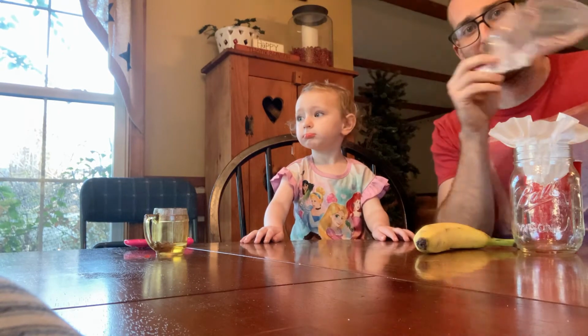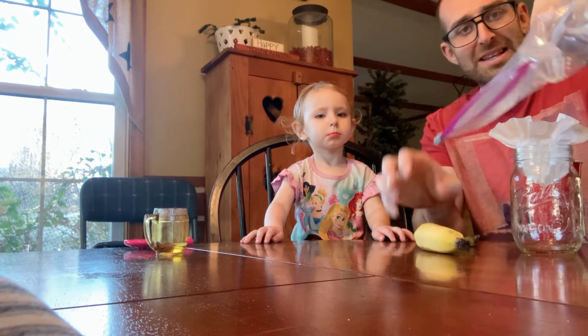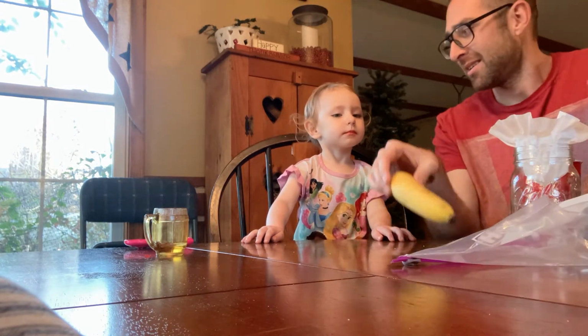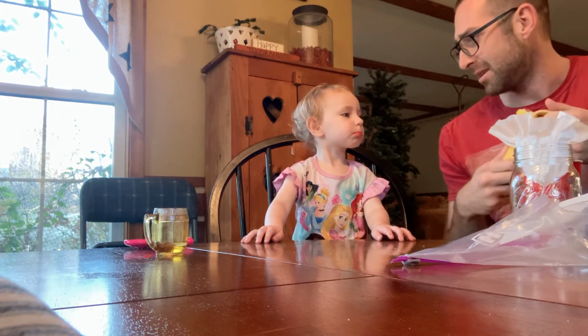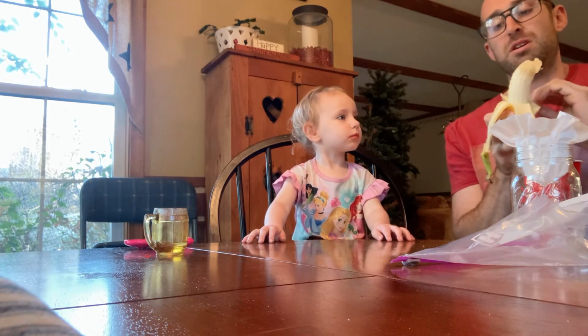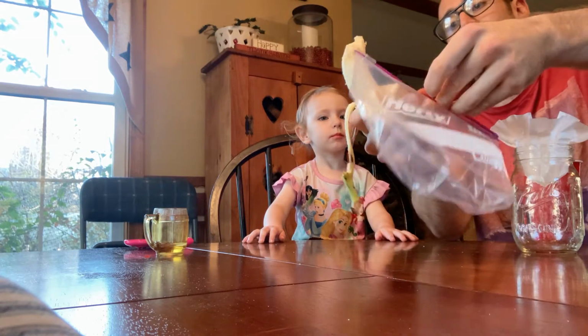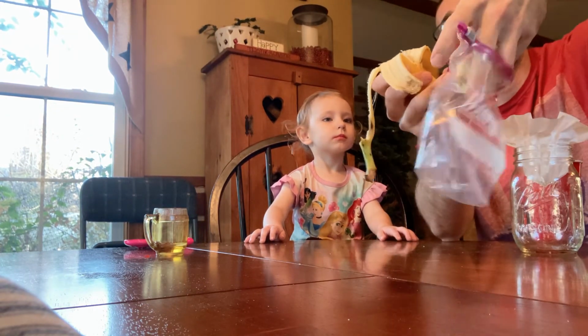All right, say hi. Hi. All right, I'm here with my lab assistant, and we are gonna extract DNA from a banana. You ready? Okay, so first, take your banana, and you want half a banana, and you're gonna put it in a baggie. Like so.